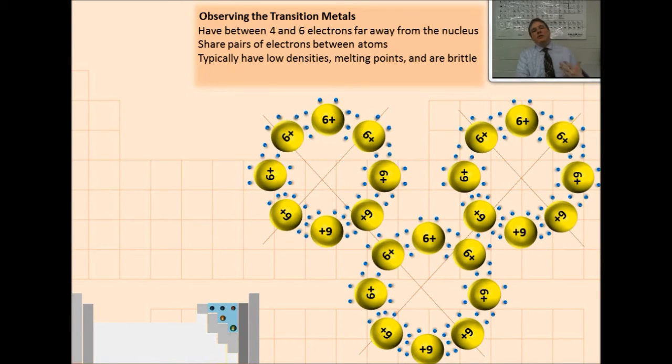Sulfur is able to form allotropes, and the way to do this is to take sulfur that's in its ring form and heat it up to make it a liquid, which actually adds enough energy to break the rings apart, so the sulfur atoms all spread out in these long lines.